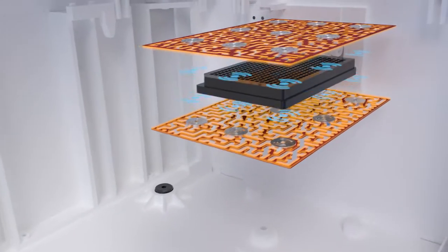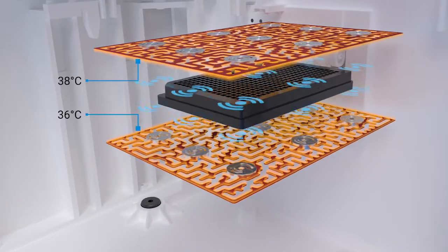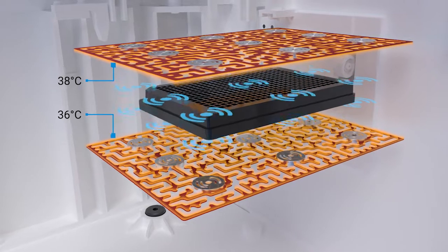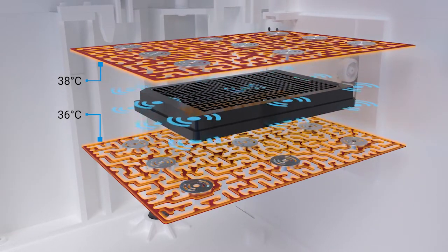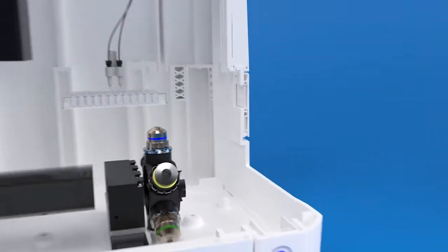C10's four-zone incubator design with condensation control precisely controls temperature by a system of sensors and heating elements. And when combined with gas control, C10 provides the ideal environment for live cell imaging.